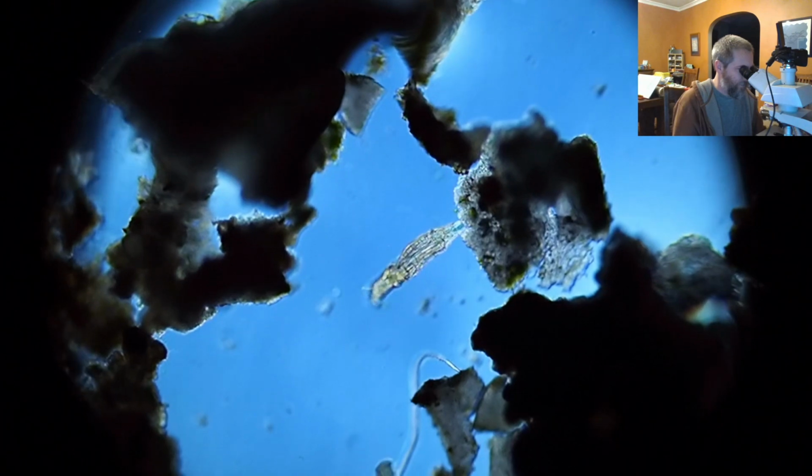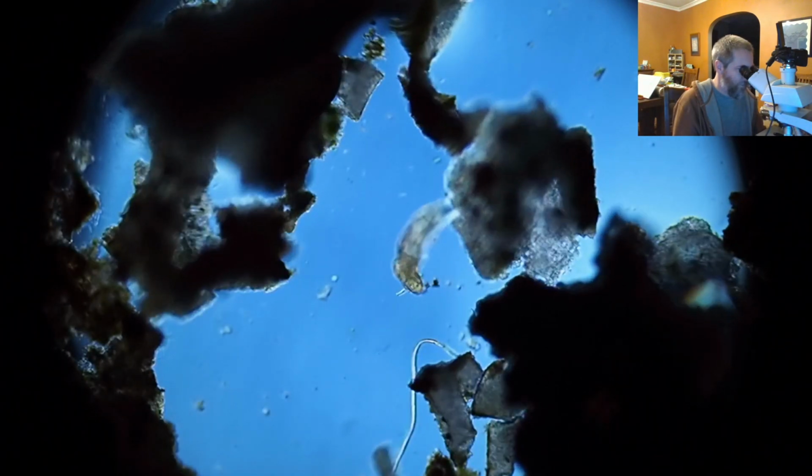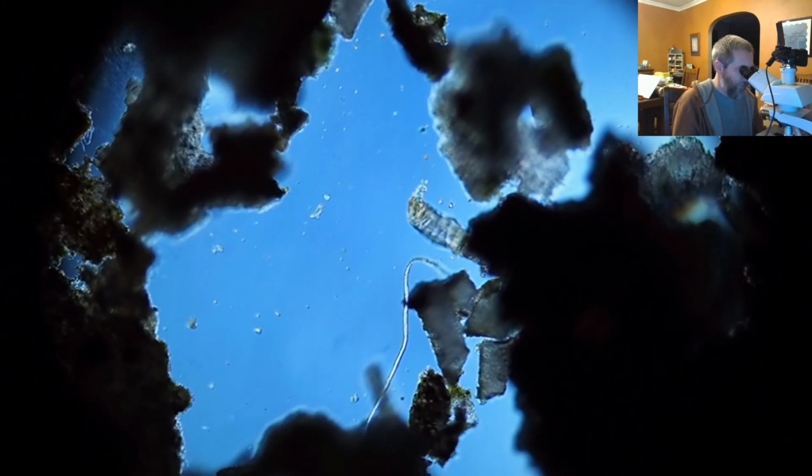They're probably at some appropriate concentration relative to the amount of food available and moisture available. So I don't know what that is. There's a rotifer. They got those long, stretchy bodies and just one foot on the back end that they use to kind of hop around with.